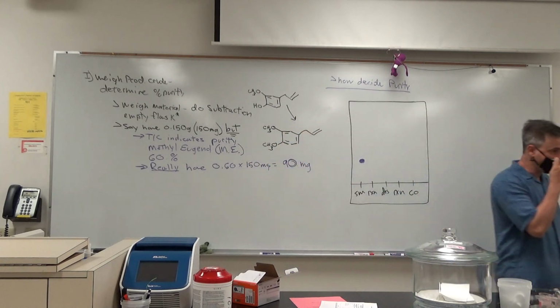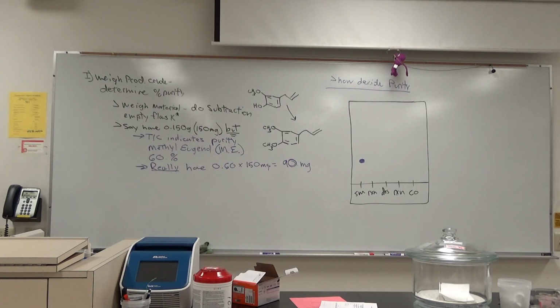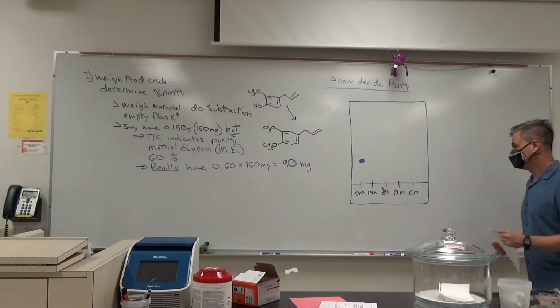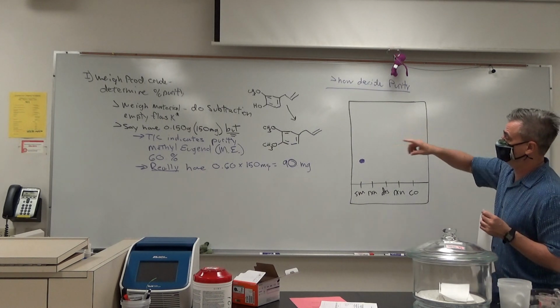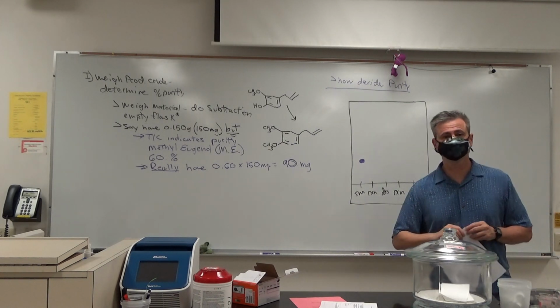Now, your advanced TLC folks, I'll put the tough questions here. Would we expect the product to be higher on the TLC plate or lower? Thoughts? How do we make that decision? Polarity. It's based on polarity, so you have to decide which one's more polar. Which one is more polar, top or bottom?